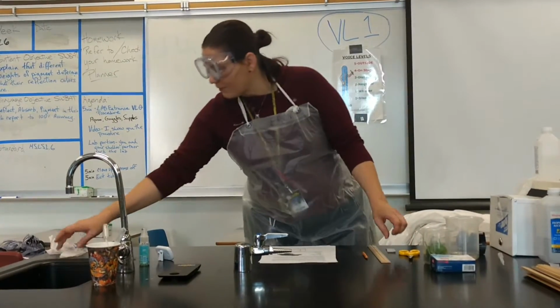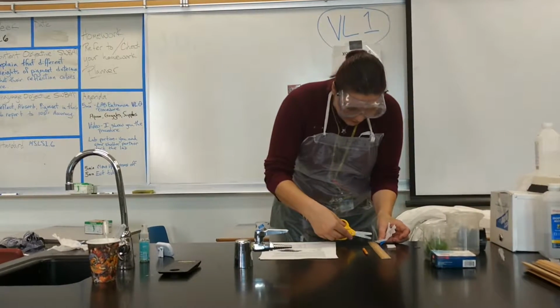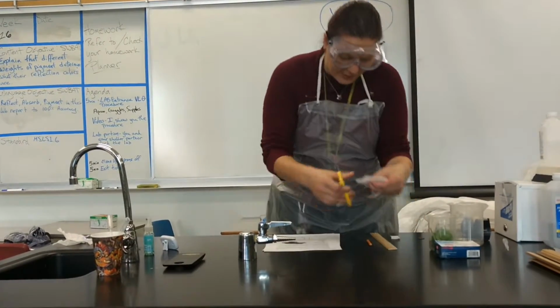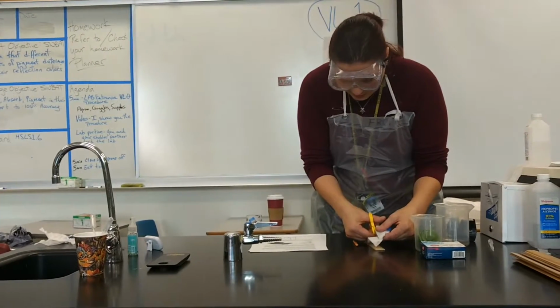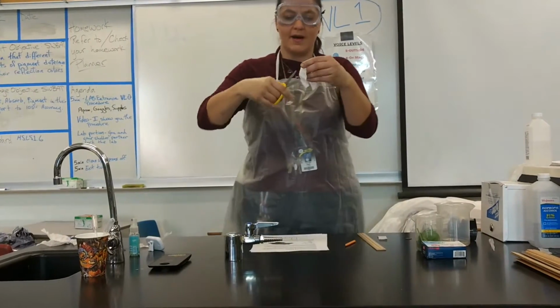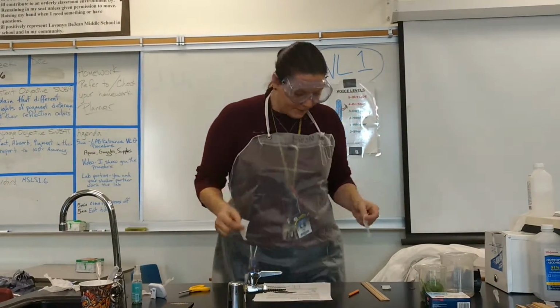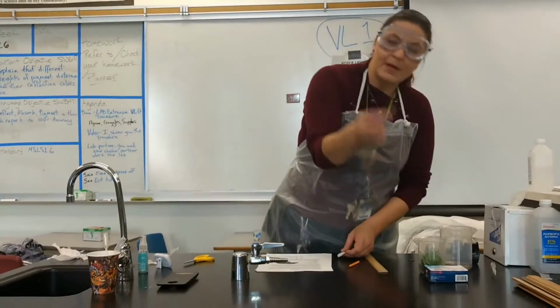All right, now that we've made our cuts, I've taken it, I've measured it for 2 centimeters. Oops, almost did 2 inches. And then I measured my cup for 2.5 centimeters by 8 centimeters long. And since I folded it over, I now have, which is perfect, 2 pieces, one for each shoulder partner pair of a table.